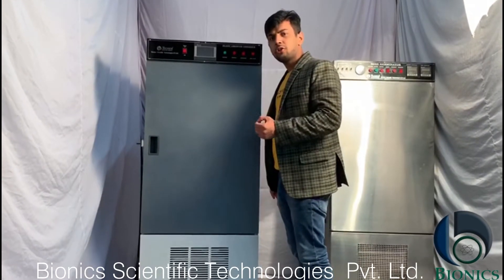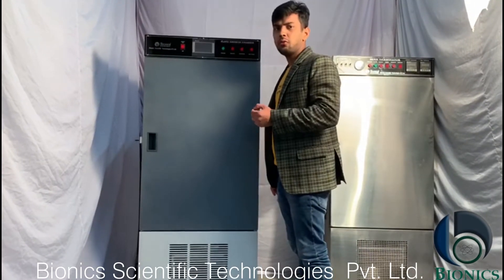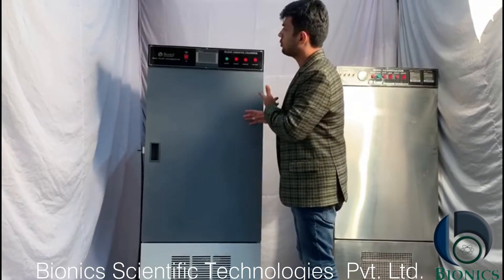Welcome to Bionic Scientific Technologies Pvt Ltd. Today I am going to tell you about this plant growth chamber.